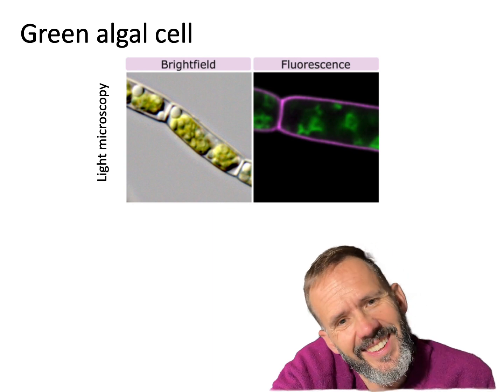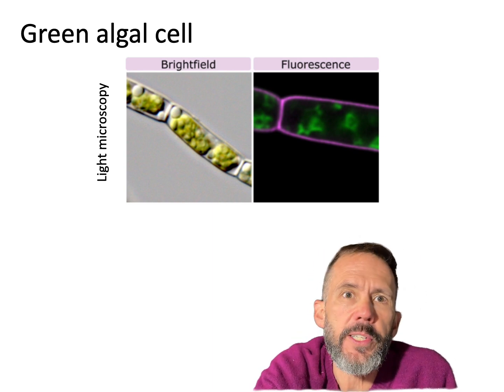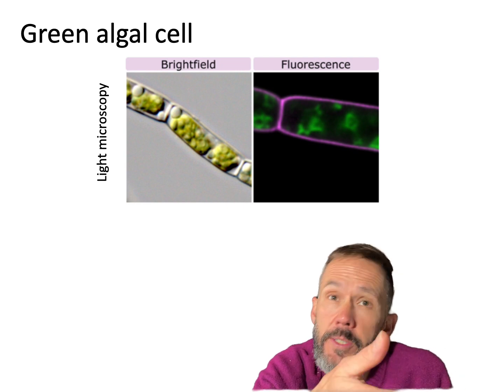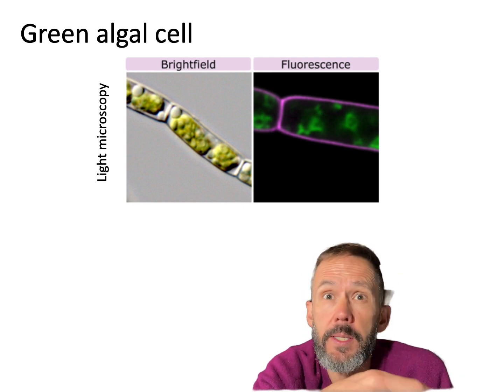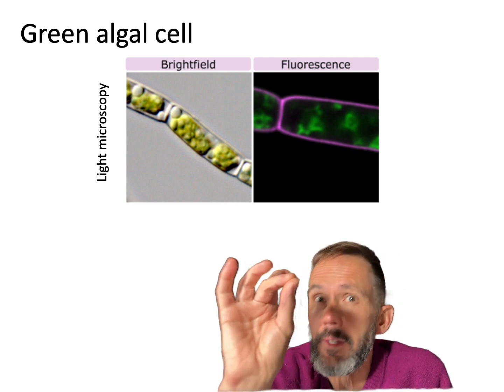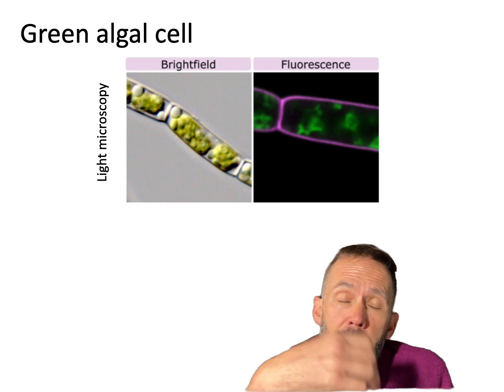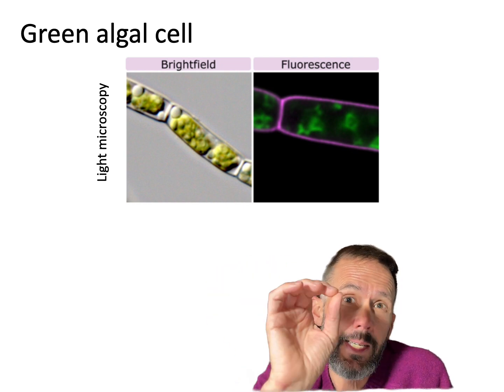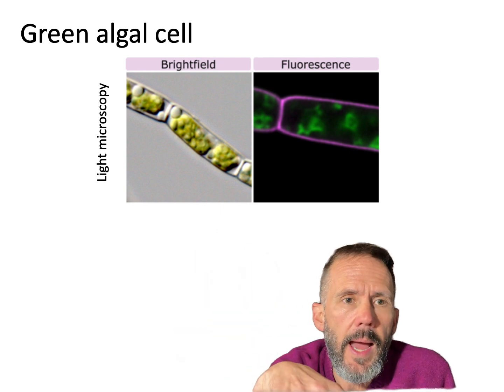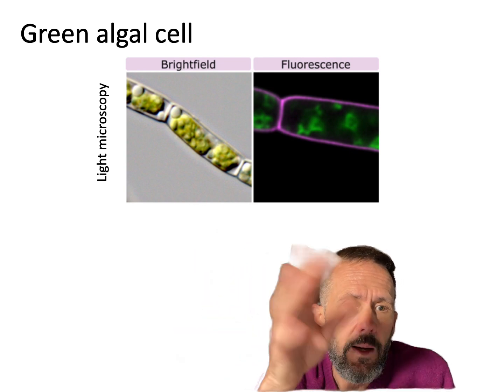Tough to tell. I don't know what it's staining, but some sort of subcellular structure that they want to specifically identify, right? So we looked at the advantages of fluorescence microscopy, that you can come in and highlight a specific protein or a specific structure that you can't see on the left here, right? You can see beautiful cellular structure, but you can't tease out individual players and biochemical cascades and things like that. But with fluorescence microscopy, you can use those stains, and you can do that.